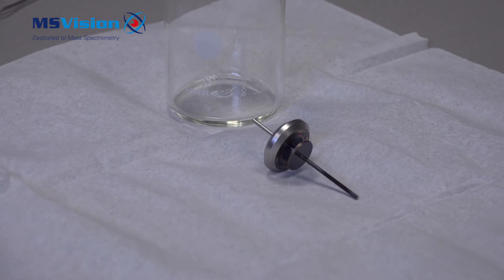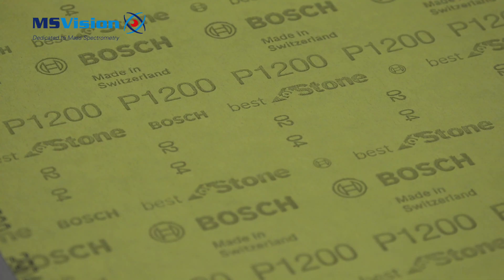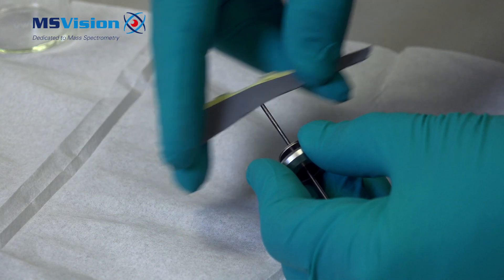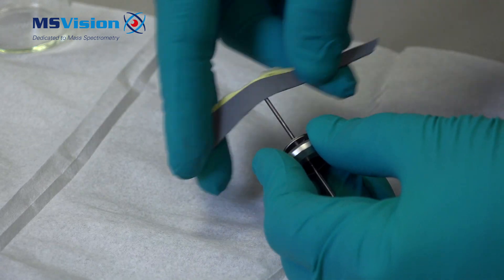You can use ultra-fine P1200 grit paper to help clean the filament. Clean evenly and only take the surface contamination from the pin.